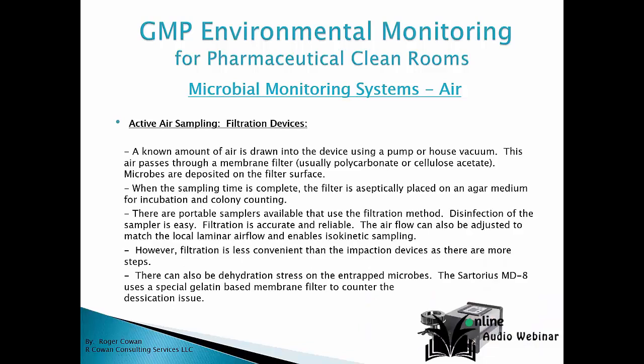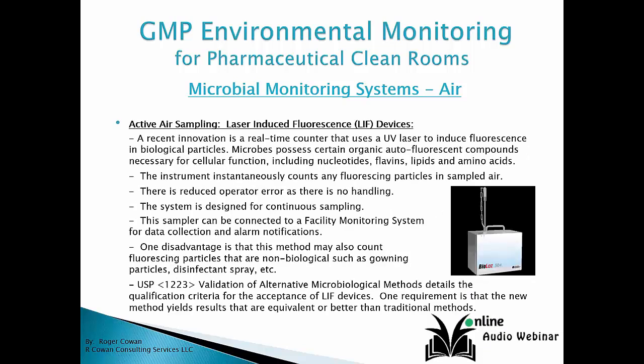There's another type of active air sampling, and that's using filtration devices. The third type of device that's used these days for active air sampling is a recent innovation. It's a real-time counter. It uses an ultraviolet laser.